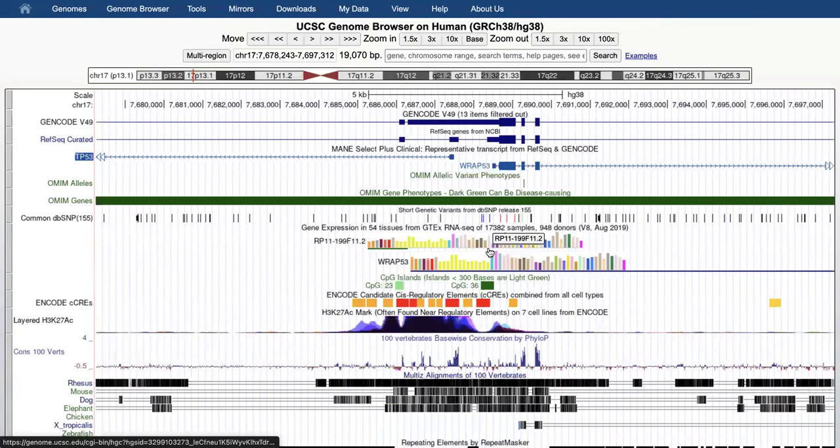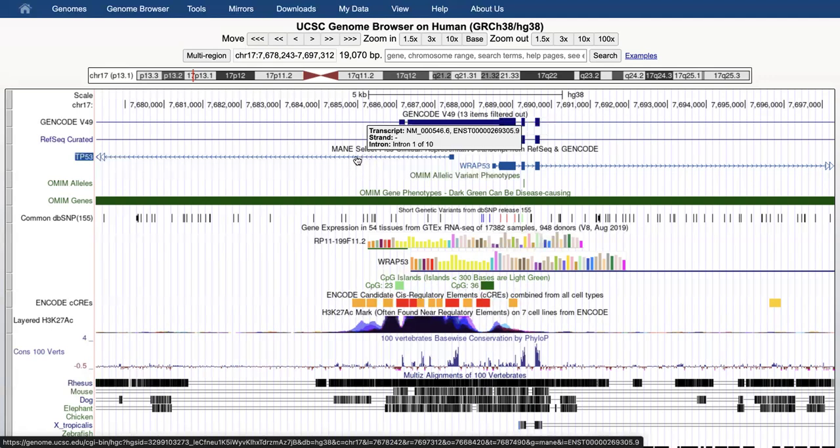What that does is it just gives you a reference of other analyses performed of different variants across this gene, just for comparison. These really thick blue boxes demonstrate the presence of an exon, whereas these skinnier lines demonstrate the presence of an intron.